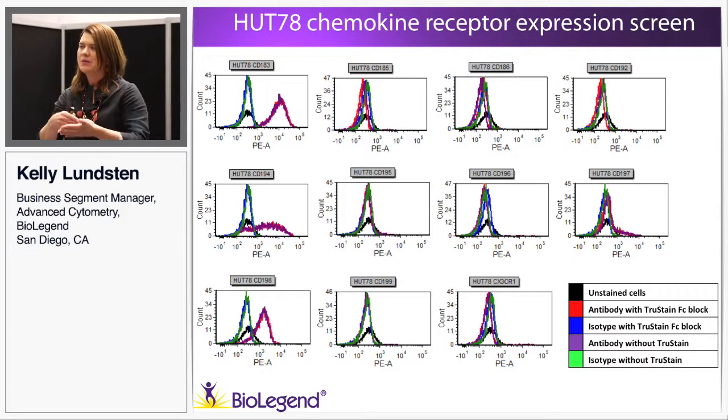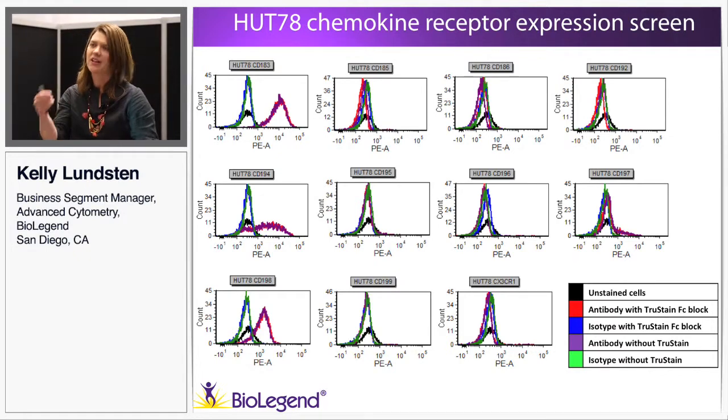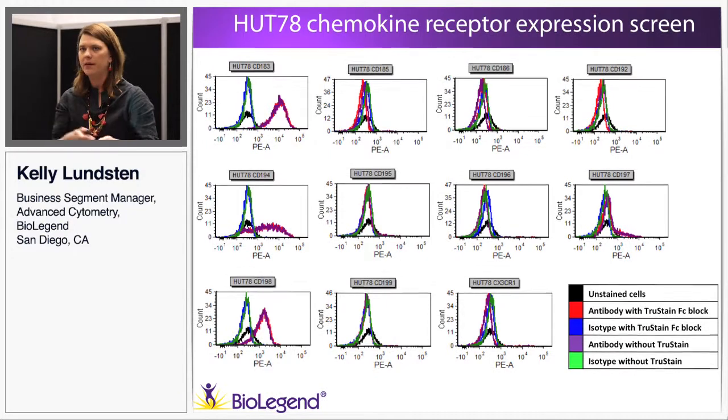And again, we're using the absolute cell counting beads to do the cell count in the end as well, and that's a certain amount of variability.